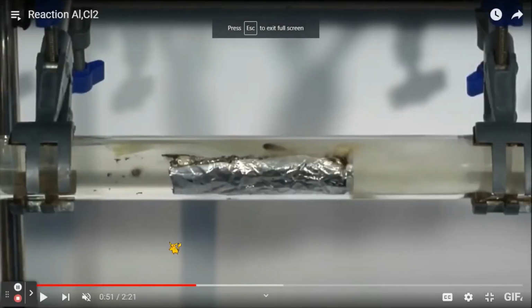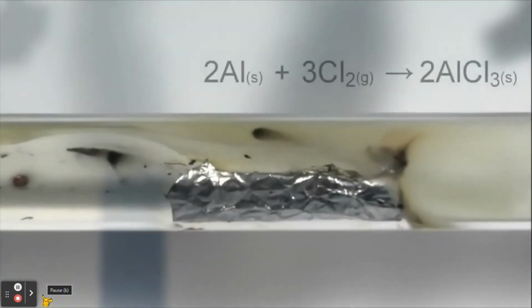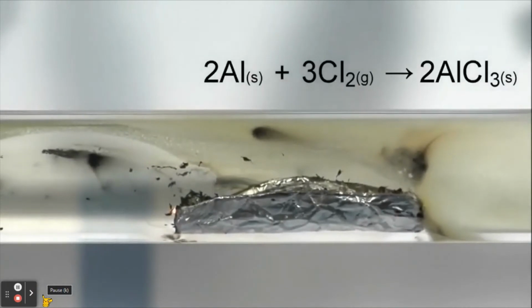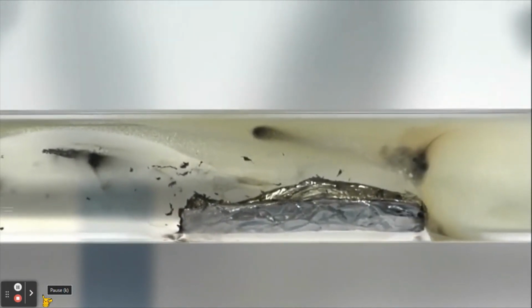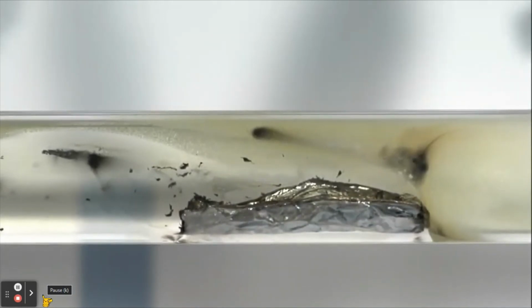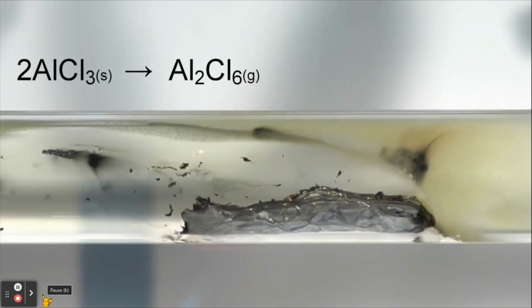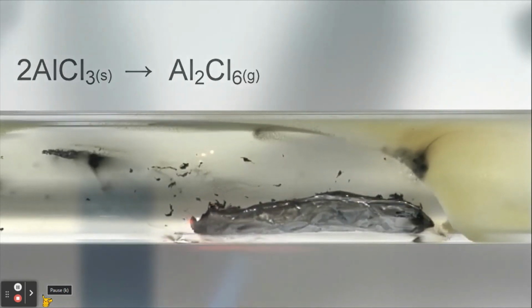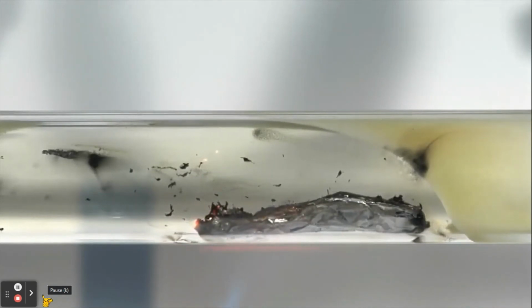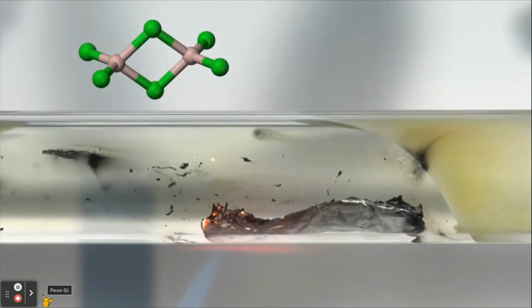So I'm just going to run this to completion. That is the reason why you need excess chlorine. So you can actually see all of the aluminium really is reacting there. Let that pass all the way through. Okay, so you'd continually heat it. You continue to make that aluminium chloride. You can see the little Bunsen right at the bottom is heating and making sure that the rest of that aluminium is reacting.